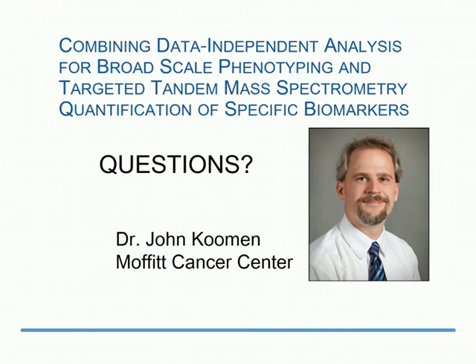Okay, next up, we've got a good list of great questions here. Next is, how many peptides can be detected per tandem mass spec in DIA, and what's the limit of acceptable complexity? Yeah, we're still doing the counting on that, unfortunately. I was really hoping to get an answer by now, but we have seen multiple things identified in each tandem mass spectrum, so there definitely is good value to doing it that way, and it indicates that you get better content than from a DDA. But to get an average, I think we want a rolling average per mass window over time, so we can evaluate how complex the peptides are coming off the HPLC gradient at any given time, and we'll get a much better idea of the value in particular parts of the experiment.